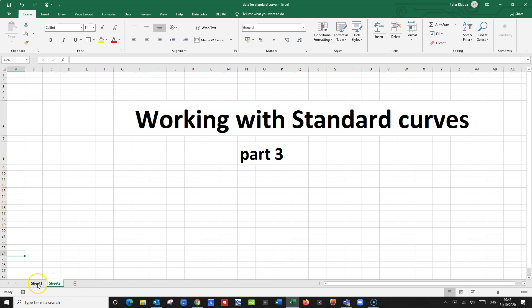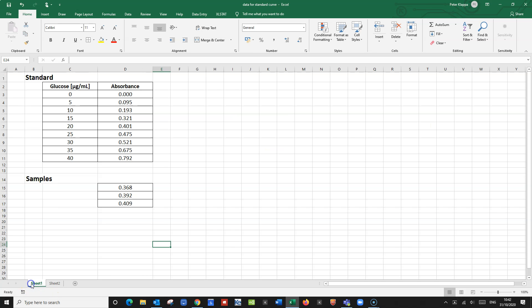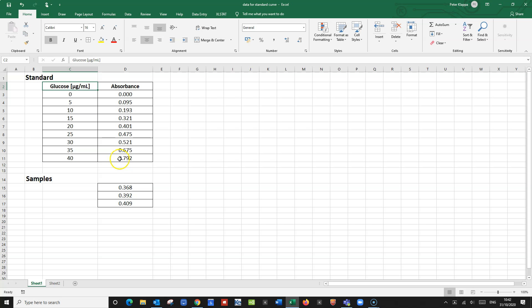Here are the data that we have been dealing with for our standard curve. These are the concentrations we have chosen, and we have calculated how much of the stock solution we need to get to these concentrations. We make the measurements in a spectrophotometer and record the absorbance at the right wavelength. So how can we now convert this into a nice standard curve?